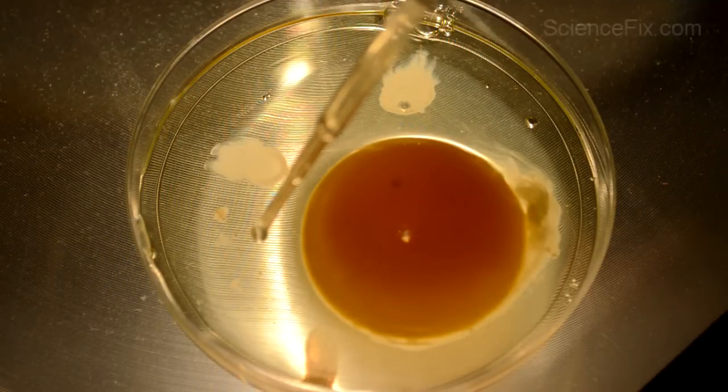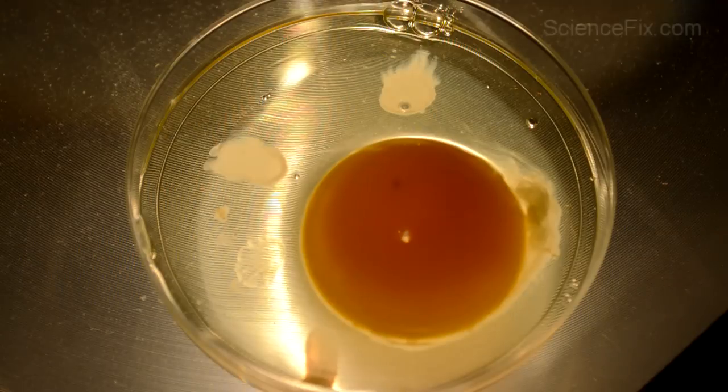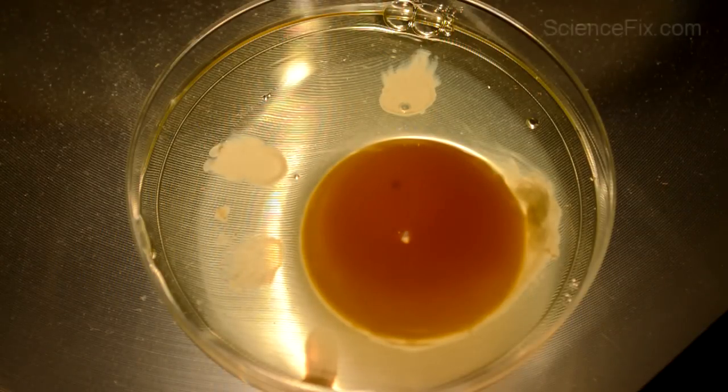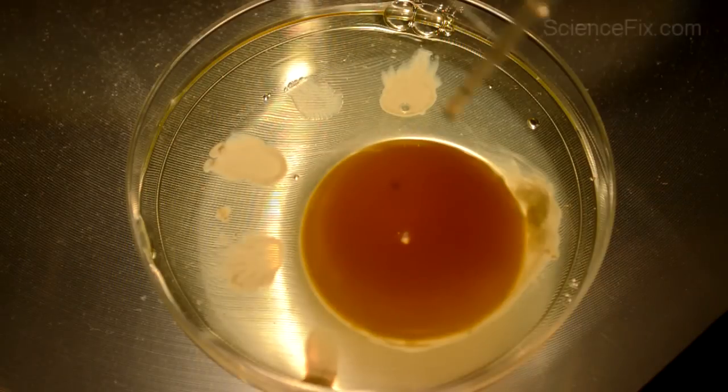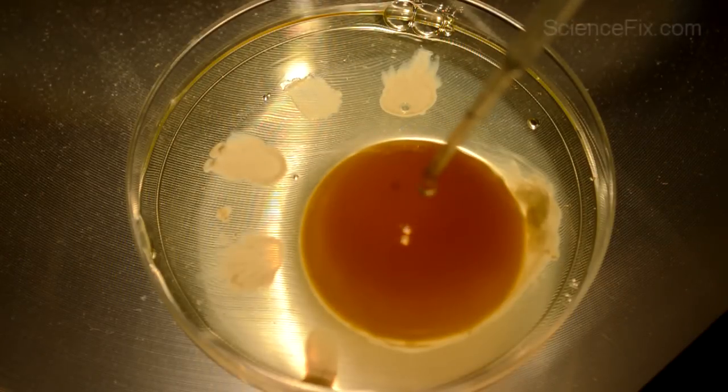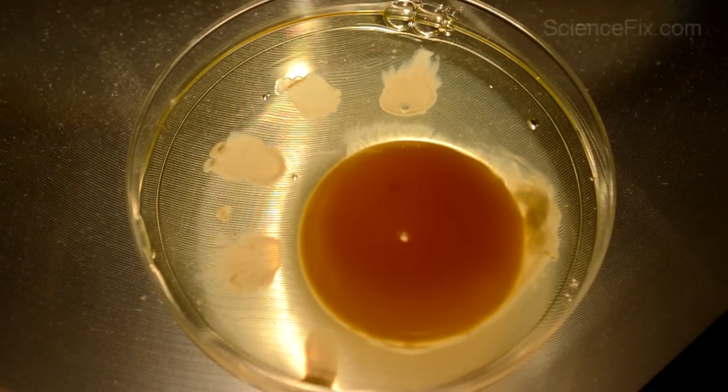So it's kind of like the cornea or the liquid in the eyeball. It's not exactly the way it happens, but the whole point of this is to show students that if you get a chemical like an acid into your eyeball, it can cause permanent eye damage.